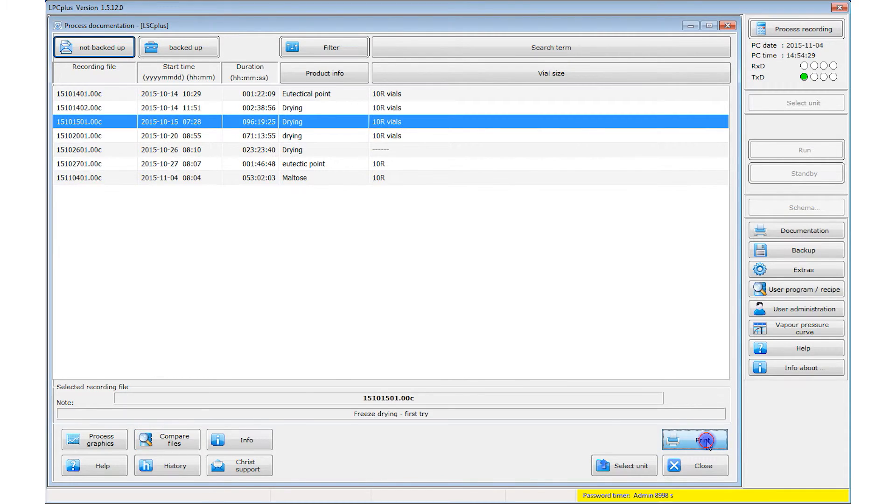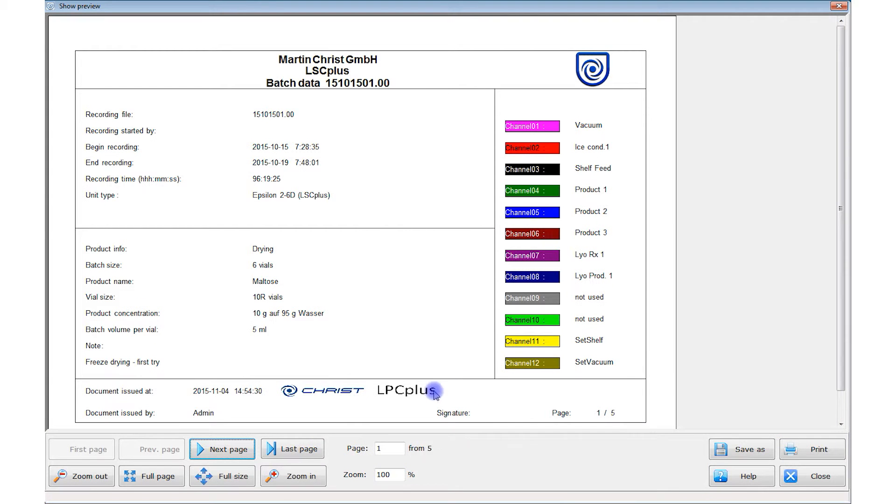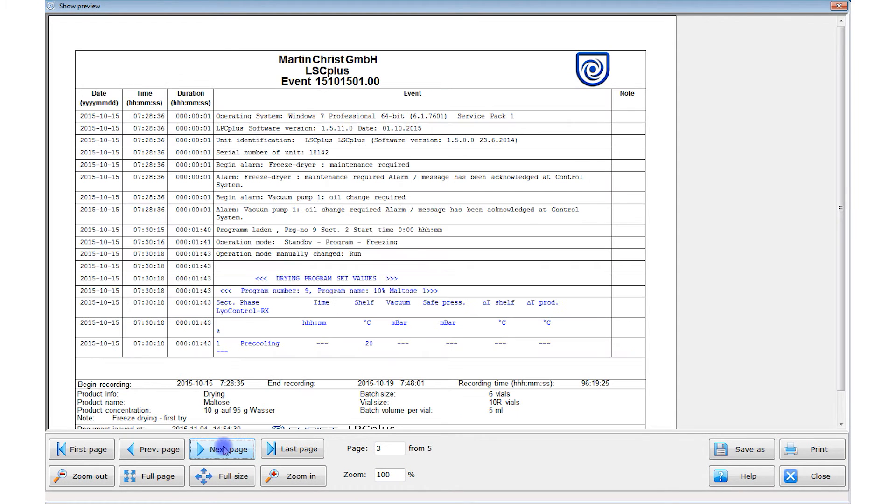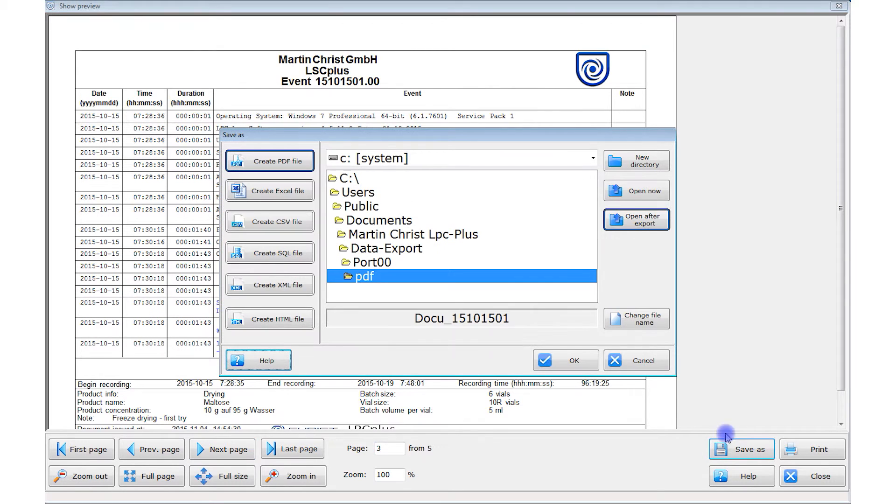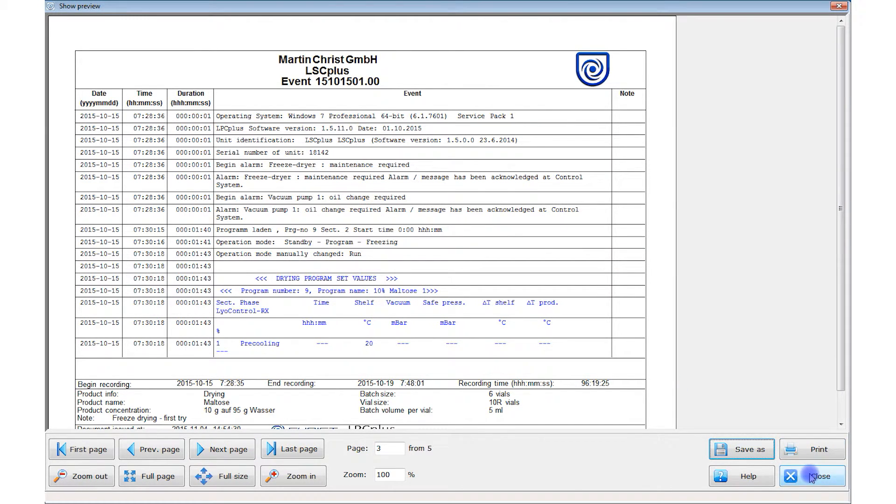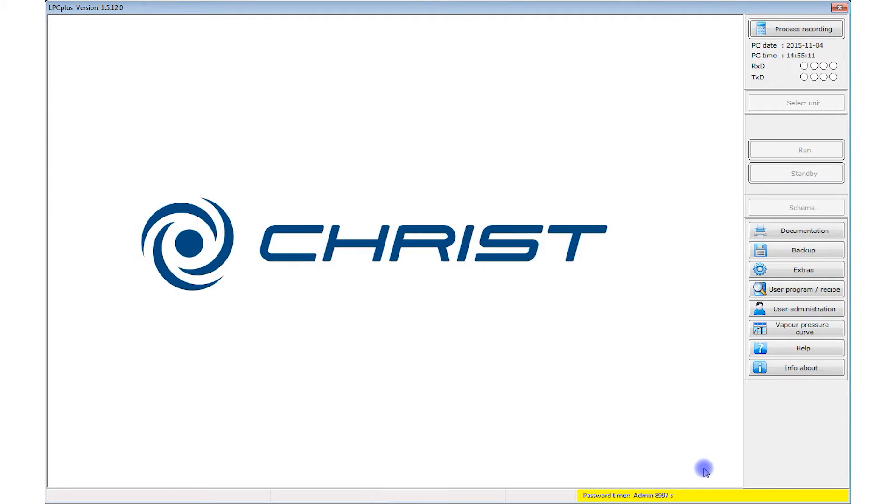You can output the process documentation to a printer, as a PDF file, or in several other formats. Now we have covered the key aspects of running and documenting freeze drying processes.